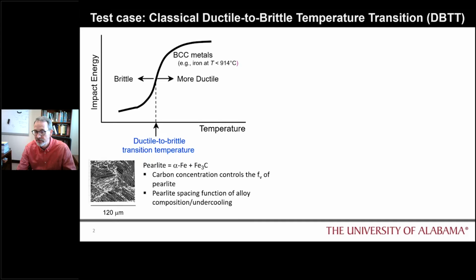We performed three different cuts. One cut has the beam perpendicular to the lath interfaces, as generically shown here in this cut 1 schematic. We made another type of beam in which the major axis of the beam is parallel to those lath interfaces. And then we have a cut 3 in which the beam is cut at some angle, roughly 45 degrees to those lath-like structures. So we have temperature variations, and we also have lath orientations.